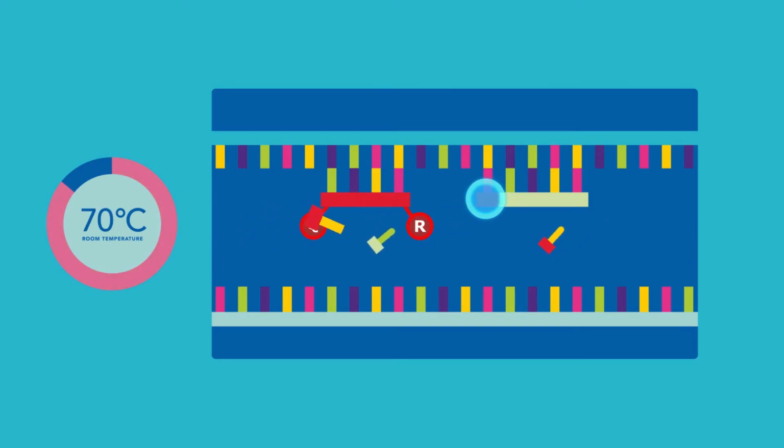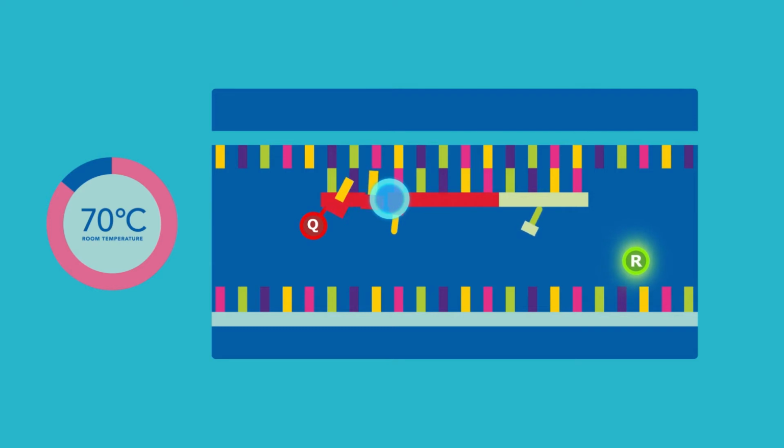During this phase, DNA polymerase extends the sequence-specific primer with the incorporation of nucleotides that are complementary to the DNA template. The DNA polymerase then displaces the reporter molecule from the probe, resulting in fluorescence. The fluorescence accumulates as cycling of PCR continues and is measured at the end of each PCR cycle.